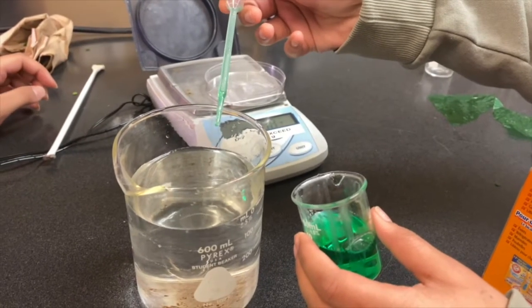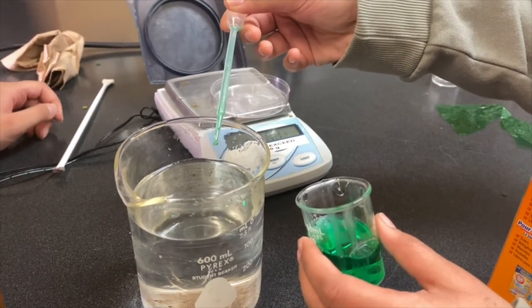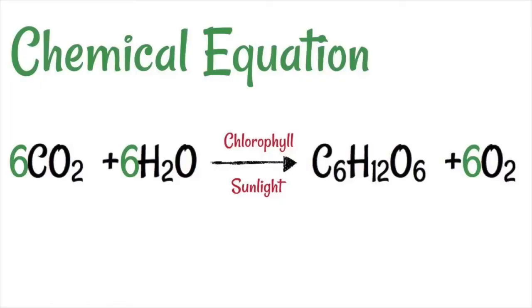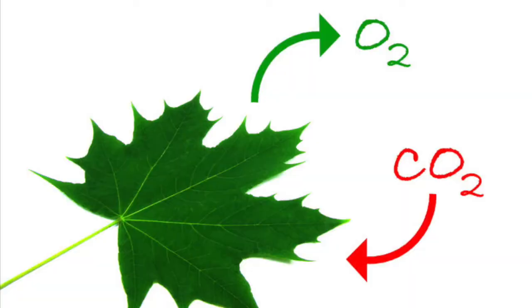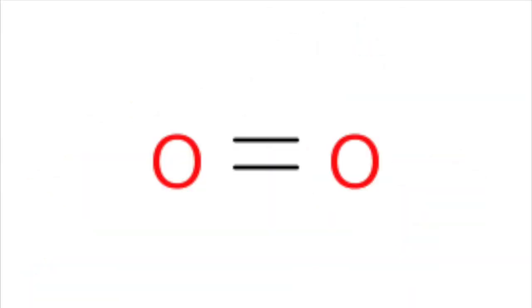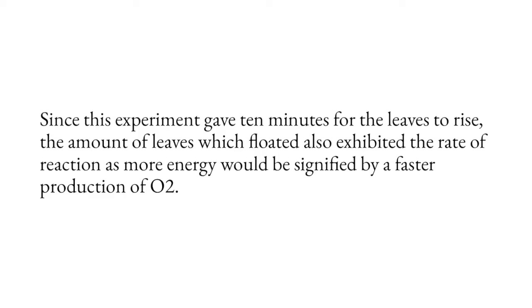Additionally, to explain the addition of baking soda and dish soap in the experiment, this was done to make a bicarbonate solution and provide carbon for photosynthesis. The experiment was measured based on how many leaf discs were floating after a certain amount of time, because this shows how much O2 was made, as oxygen gas produced through photosynthesis would have nowhere to go in the water, thus making the leaves float. Since this experiment gave 10 minutes for the leaves to rise, the amount of leaves which floated also exhibited the rate of reaction, as more energy would be signified by a faster production of O2.